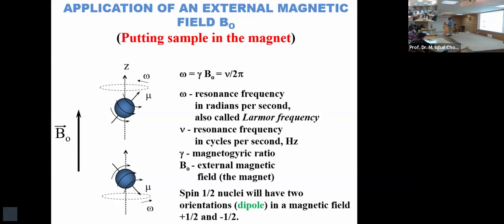When it matches, then you will be able to transfer that. If it doesn't match, it would never be transferred. So only when the precession frequency matches with the radio frequency will absorption take place. Radio frequency will only be absorbed when it matches with the precession frequency.